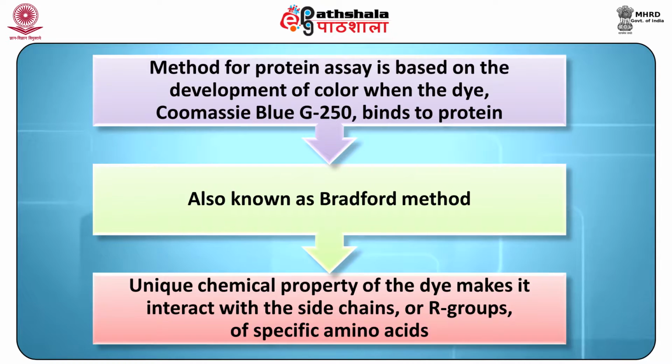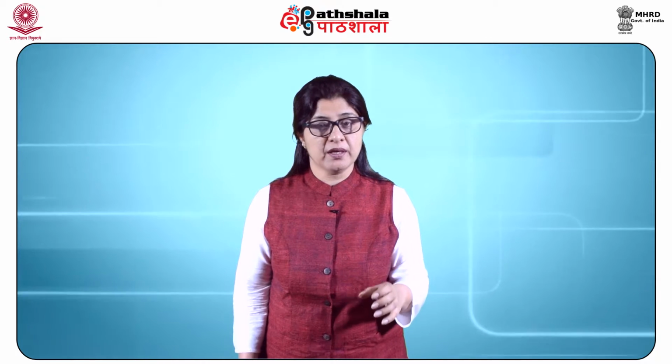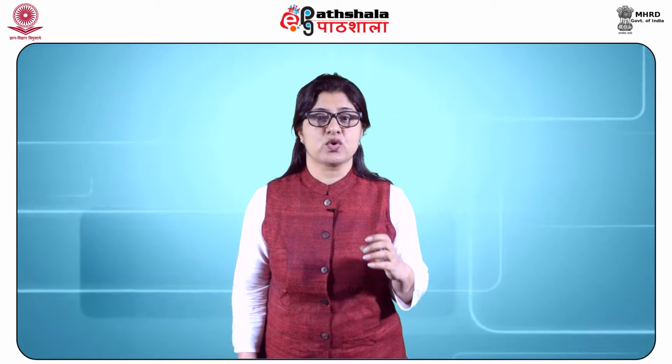Coomassie blue G250 binds to protein. It is also known as the Bradford method. The unique chemical property of the dye makes it interact with the side chains or the R groups of specific amino acids. There is a correlation between the blue color developed and the concentration of the protein in the sample. The more protein, the more intense the blue color. Quantitatively, the result is obtained using the UV visible spectrometer.